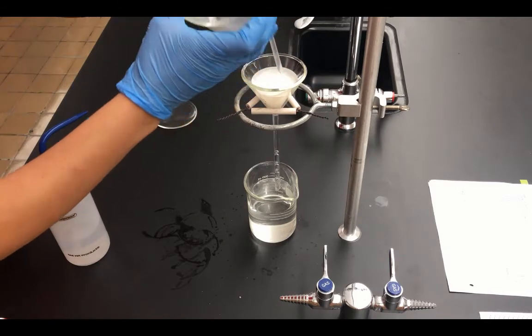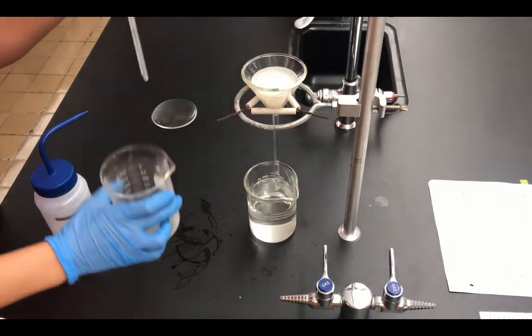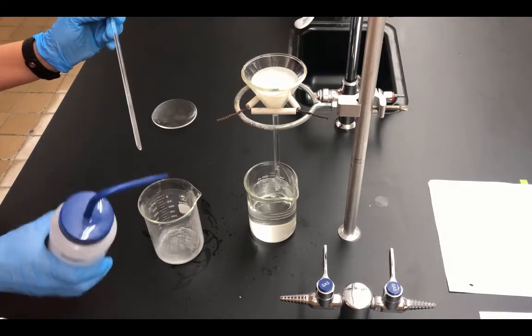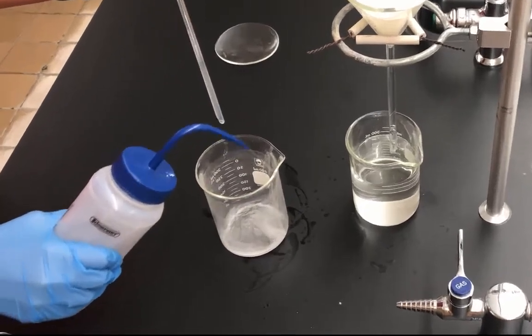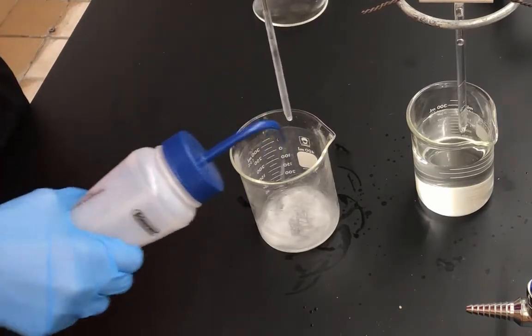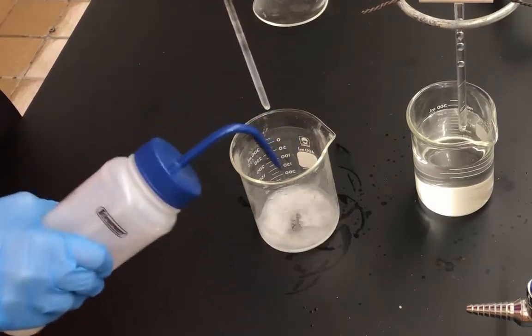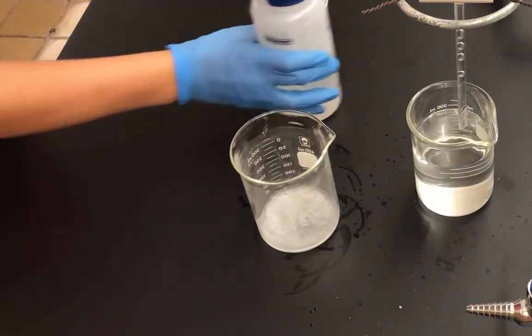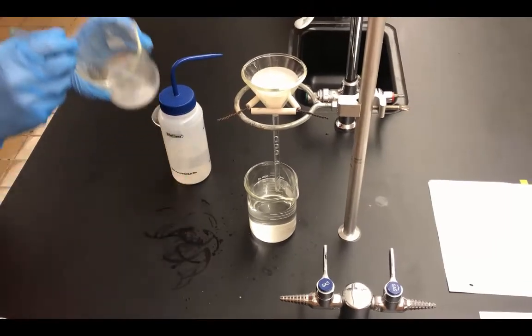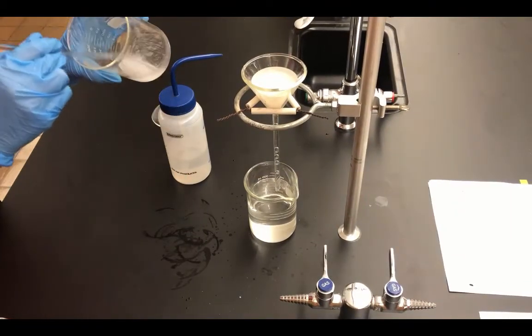And what you'll notice is that there's a lot of white solid in this beaker. So we're going to use the distilled water, and we're just going to squirt the inside of the beaker. Now, you don't want too much water, because all of the water that you're squirting into the beaker still has to go through the funnel. So what you want to do is try to get the sides. You can use the stirring rod, try to scrape the bottom.